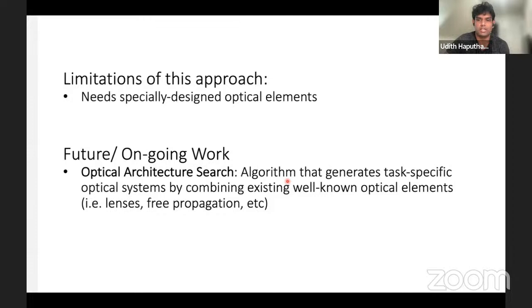In the current problem, what we try to do is make the loss landscape smoother, so that gradient based optimizers can travel through the landscape and find the optimal solution. In contrast, in this particular case we do not smoothen the loss landscape. Instead, we want a good algorithm that can traverse very high frequency loss landscapes.